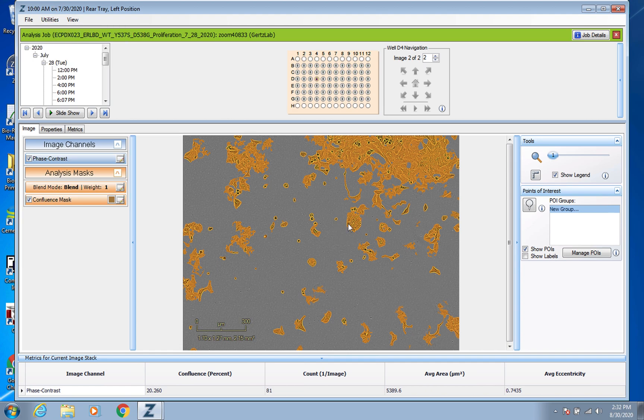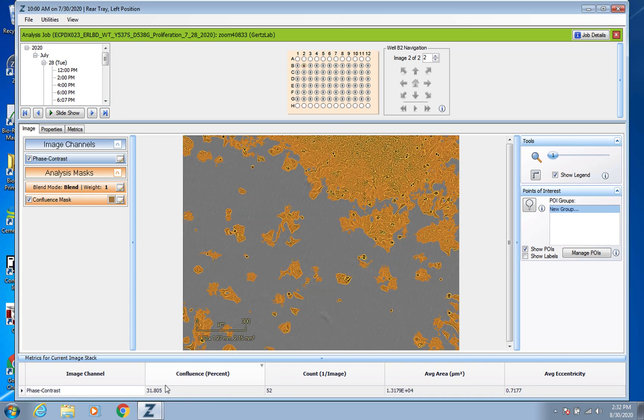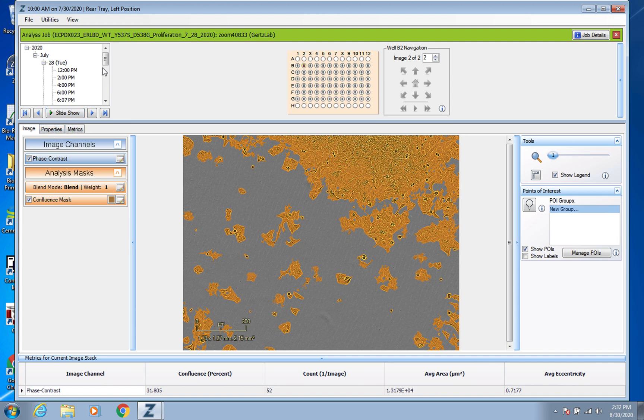But what you really want is the confluence data, right? So you can click on any well and look down here and see that it's giving you the confluence percentage it's determining based on that analysis job that you had run.